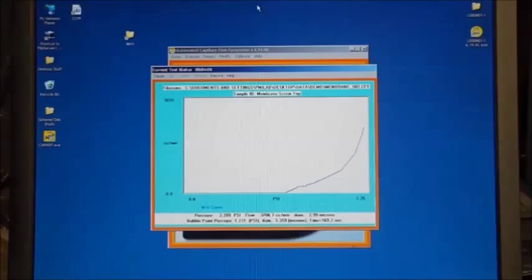The graph being displayed on the screen is tracking the flow, which is changing rapidly as liquid is being pushed out of the sample. The sample being tested here is a track etch membrane, so all the pores have approximately the same diameter, which means that the machine will detect a steep increase in flow. As it starts to increase the pressure, pressure can be correlated with pore diameter in microns, as seen at the bottom of the auto test screen. When the slope of the line on the graph starts to level off, it means that no new pore sizes have been detected and permeability has been reached.